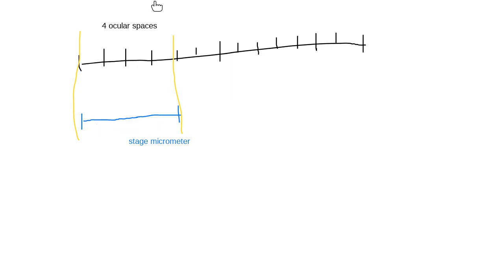This thing, we actually know the size of the spaces. Each space of this measures 10 micrometers.